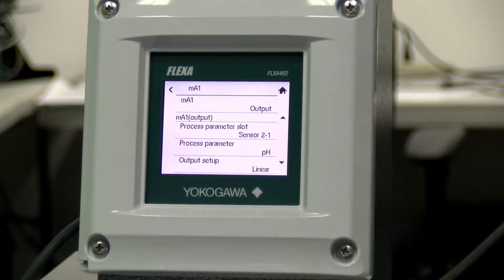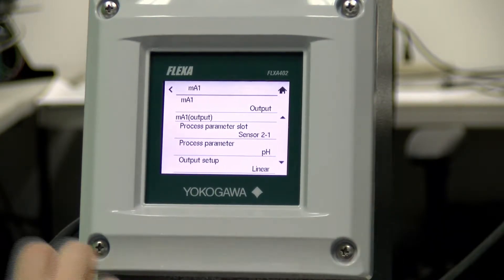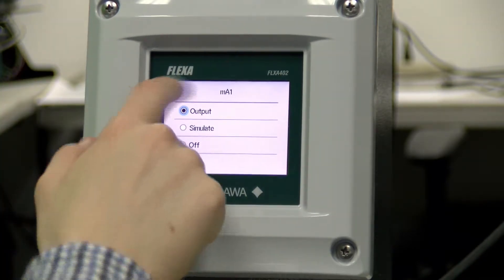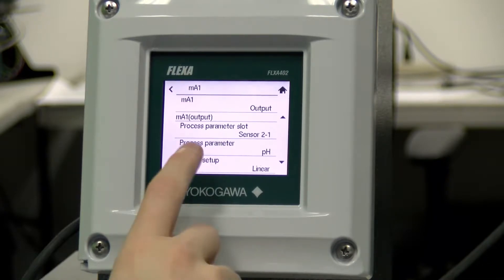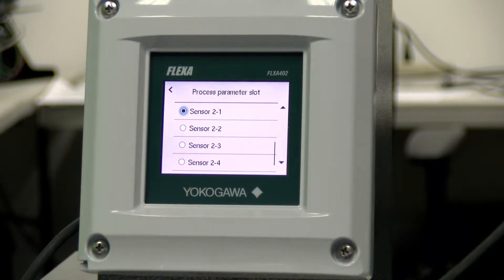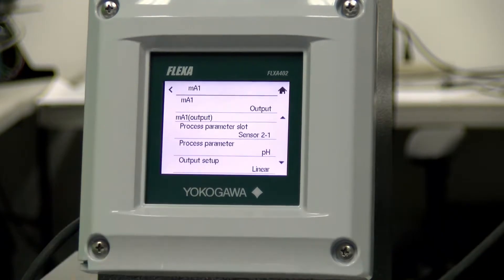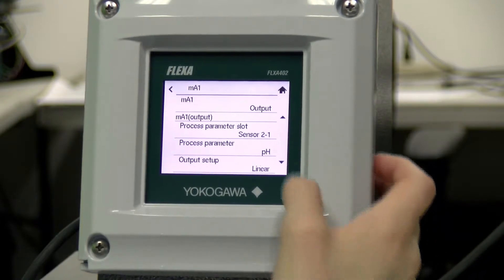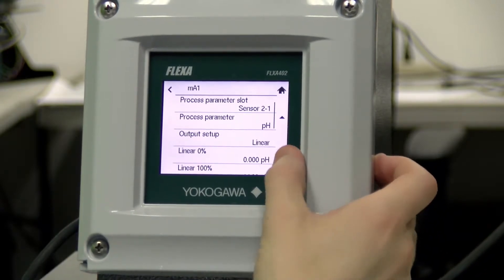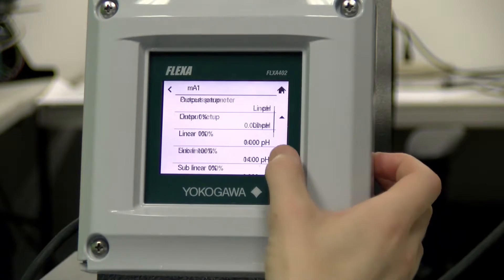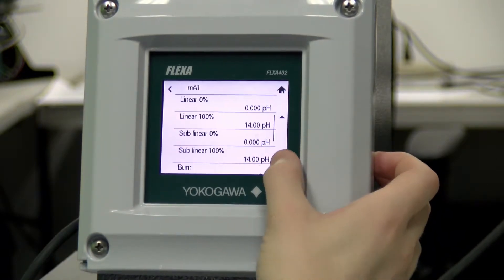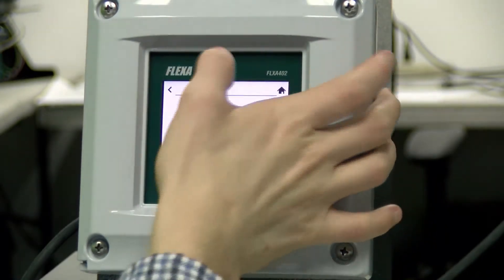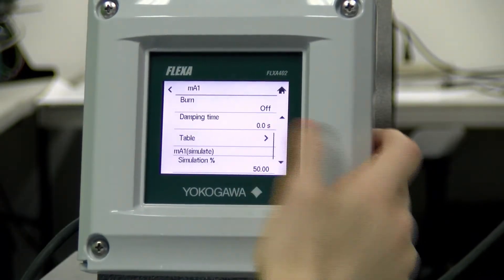The first setting we have that we can change is the milliamp output one right here. We can also choose to simulate a value. Here you can choose which process parameter slot you would like, as well as the process parameter itself, along with the output type, the linear range, the sublinear span, any burn settings you would like, and what the damping time will be.